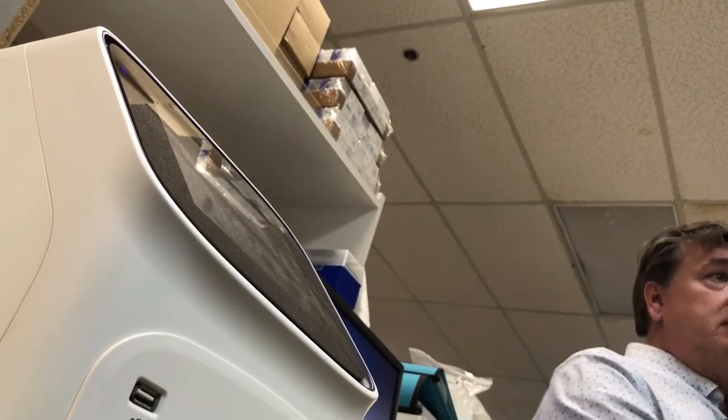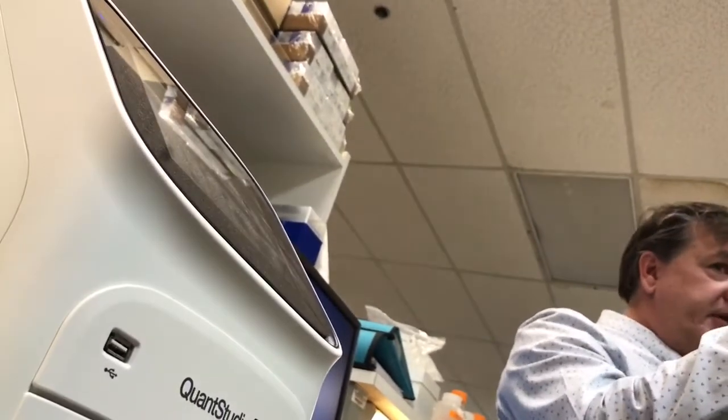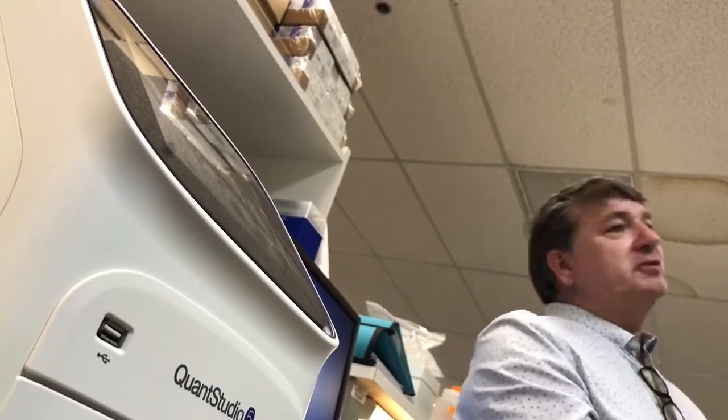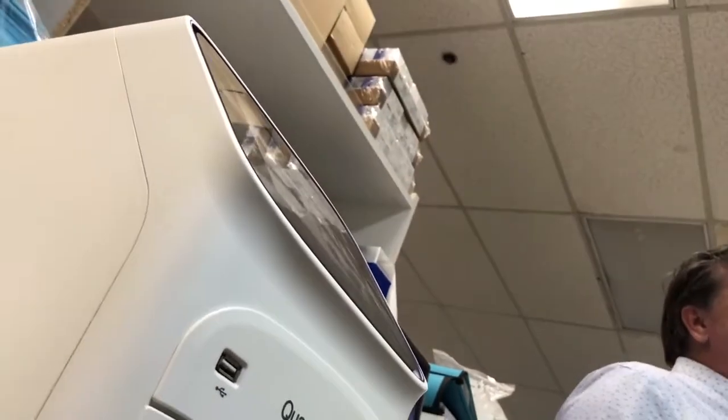Actually, when you freeze it, we have HIV, HCV and HBV samples in that freezer at -80. Those come from years ago, and they're still good and still active and test fine. Okay, fantastic.